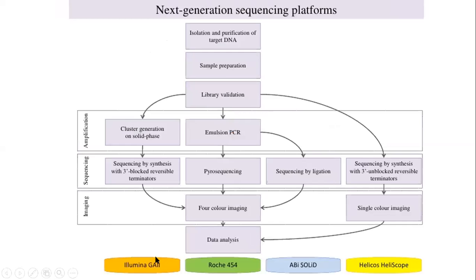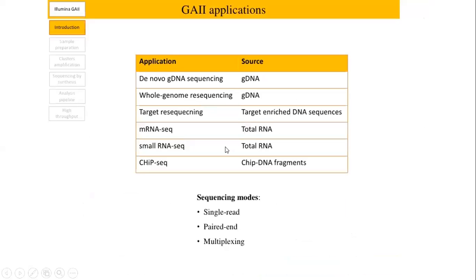Again, read through that, the different methods of NGS sequencing here. Go through how the samples are prepared. Go through these steps: amplification, sequencing, and imaging. Sequencing is either pyrosequencing, sequencing by ligation, or sequencing by reversible terminators. We might see some of these fundamentals required, but get an overall understanding of this.